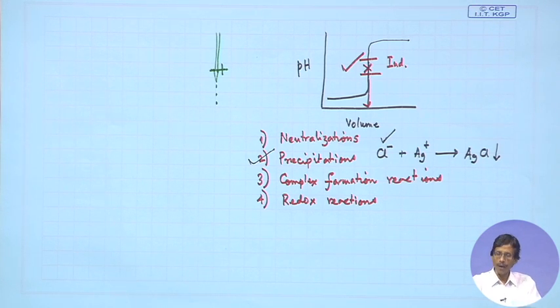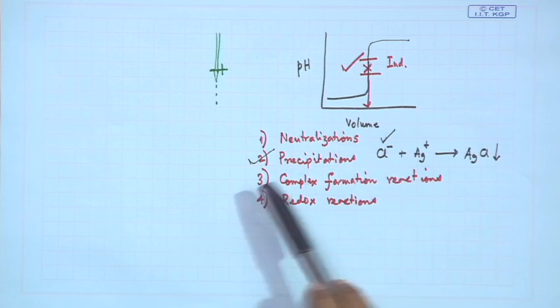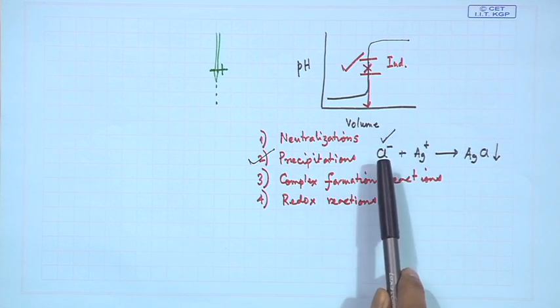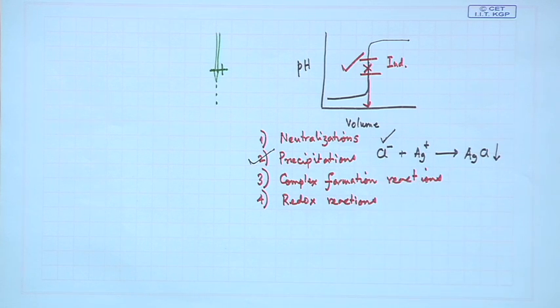This is a very vital component of any sample, like any industrial sample or any biochemical or biological sample, even in our blood fluid. So, a blood sample can also be handled for chloride determination by this particular technique.